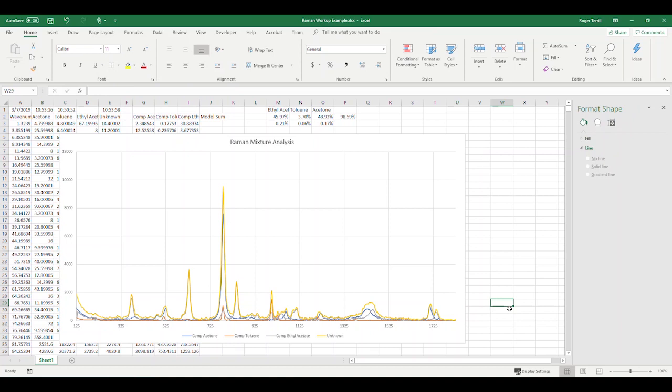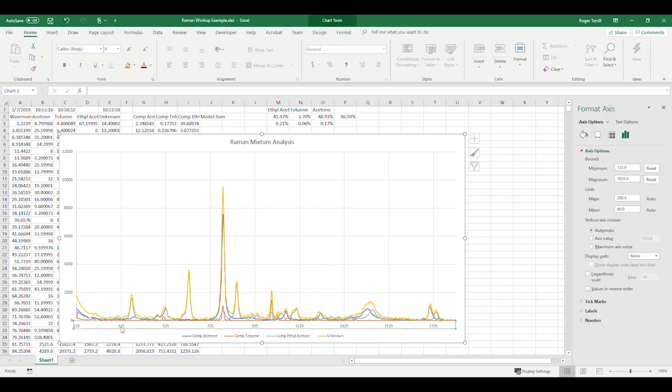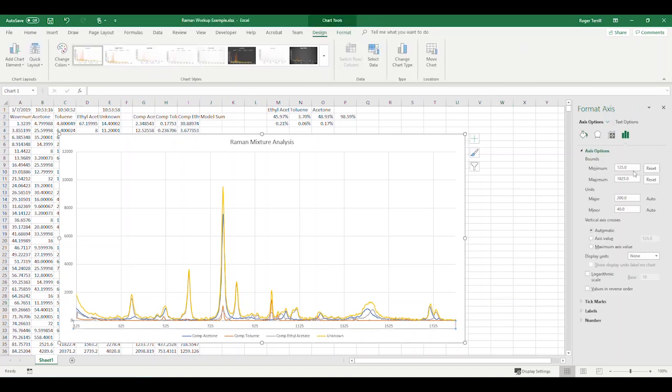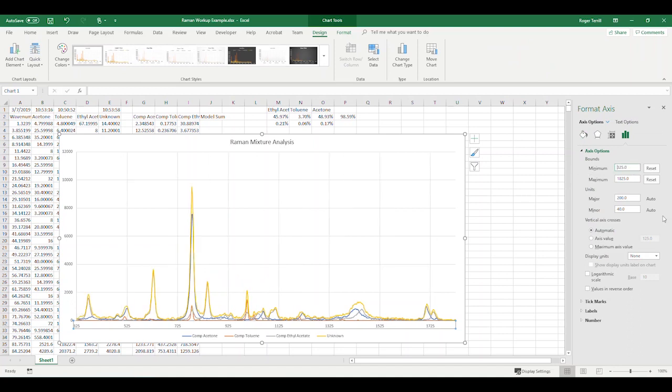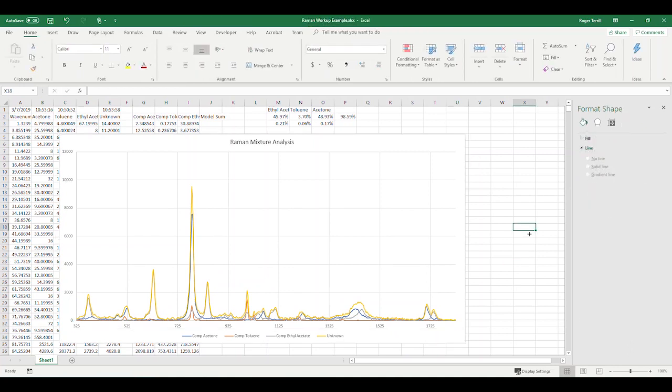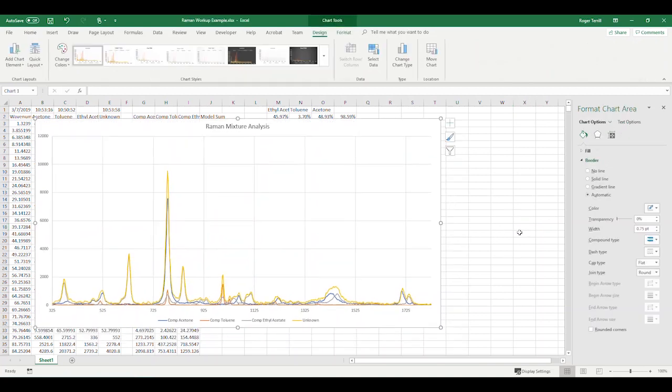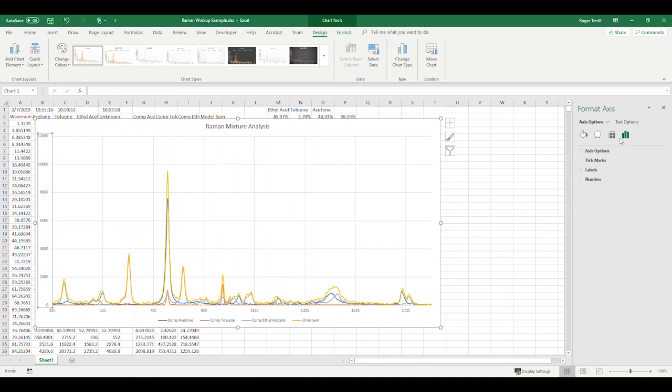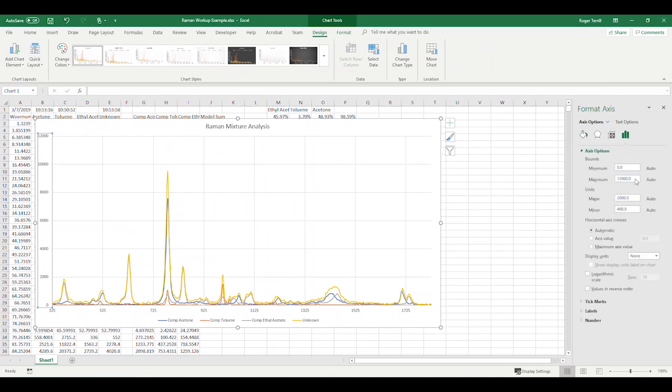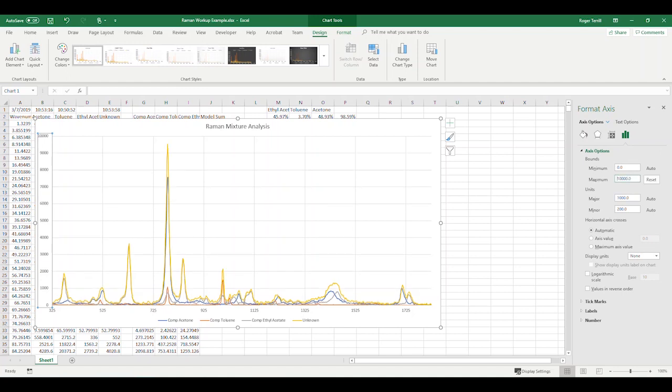Let's just change this a bit. Now let's change the horizontal axis. We're going to highlight just these peaks in here. Well, maybe to 1525. I don't know. Let's see, let's go from 5. There we go. Decongest things just a little bit more.